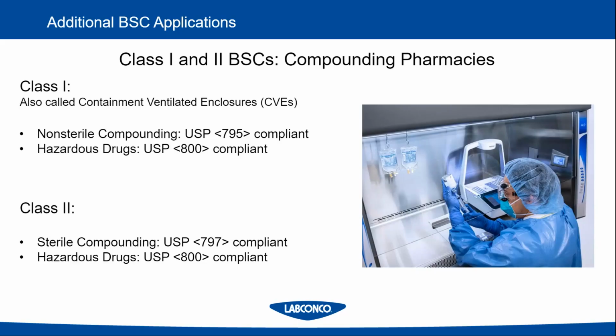But these could be drugs that are not injected. So maybe creams or ointments that are spread on the skin, things that don't need to be completely sterile, but are still hazardous to the person preparing them. These are all done in a Class 1 biosafety cabinet.